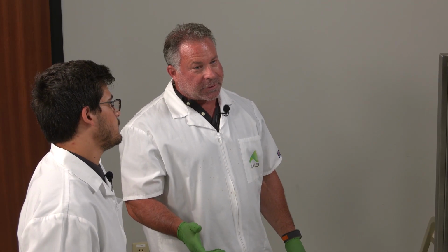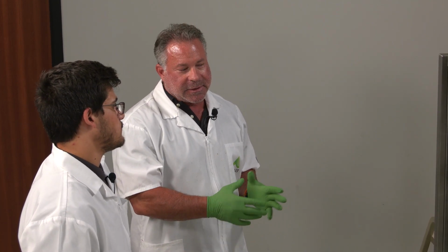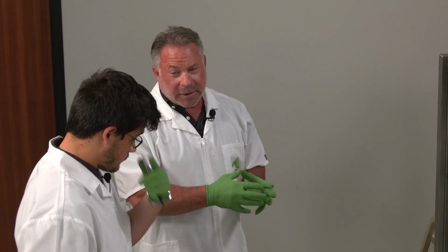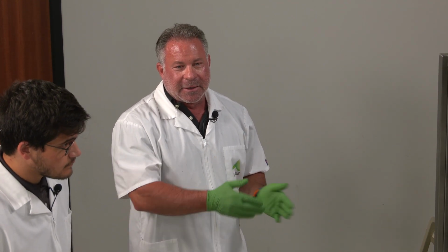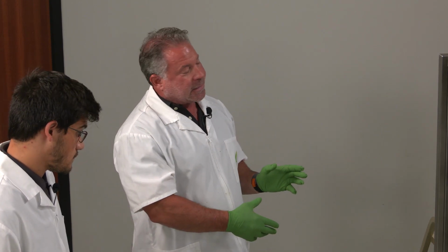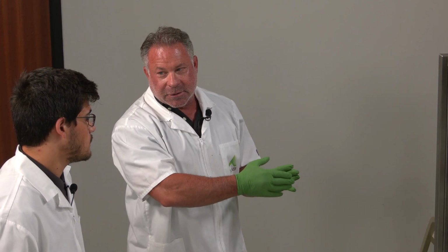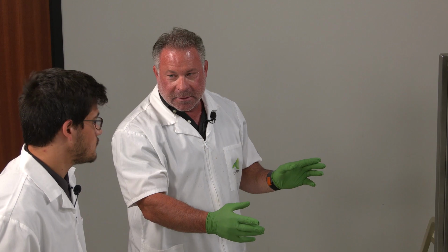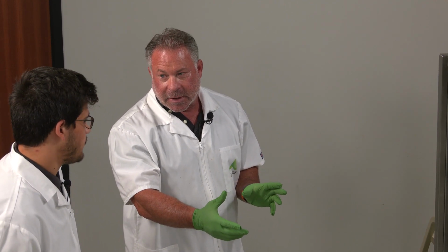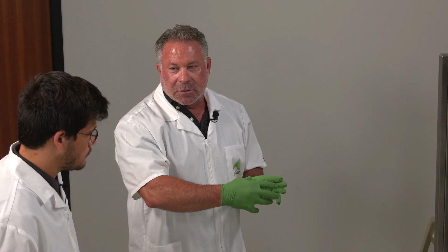Well, what we're using to separate these molecules is the principles of thermodynamics, right? So mostly we're looking at boiling pressure or boiling temperature and vapor pressure and how those relate to the molecules that we're looking at. On the other side, to get those off, I should say, we're using boiling points and vapor pressures to get them off and separated from each other. When we're condensing them, we want to use the opposite. Right. We want to use their dew point, which is going to bring them back into solution so that we can bring them out.